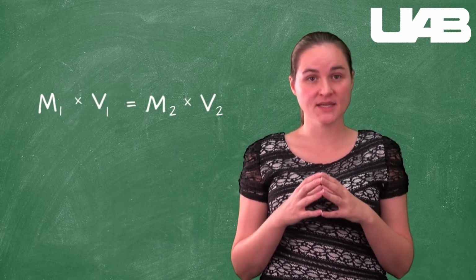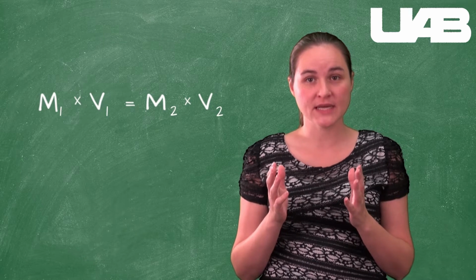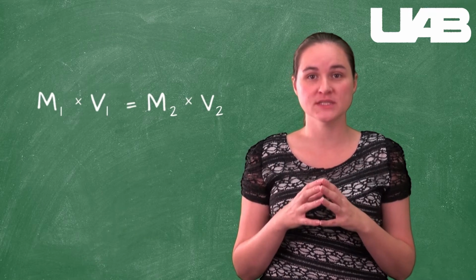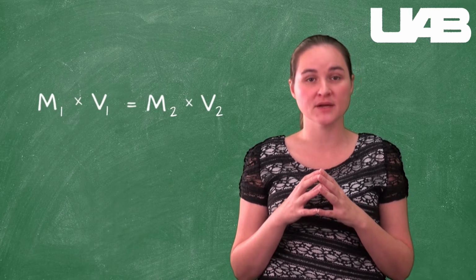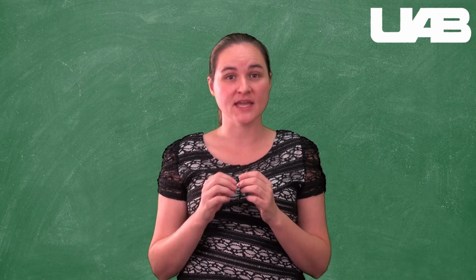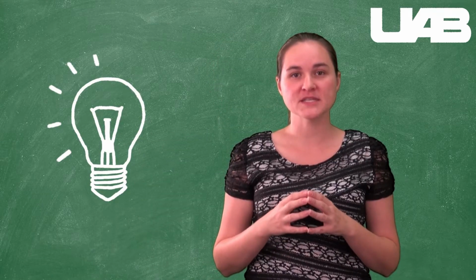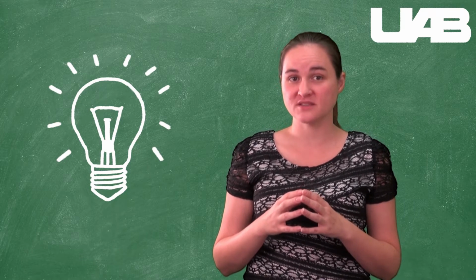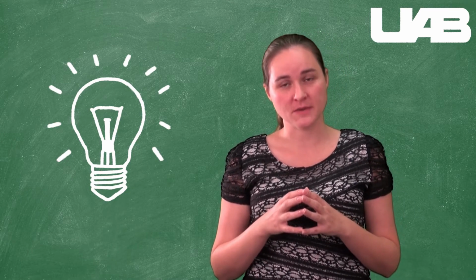Once we have our calculated concentration for our stock solution, we will use the same M1V1, M2V2 relationship we used in the density lab to determine the concentration of each new solution prepared in our serial dilution. Your spectrophotometer is actually a super expensive light bulb with a detector. The light bulb emits a known amount of light as measured based on the wattage of the bulb. Some of the light is absorbed by the solute molecules.